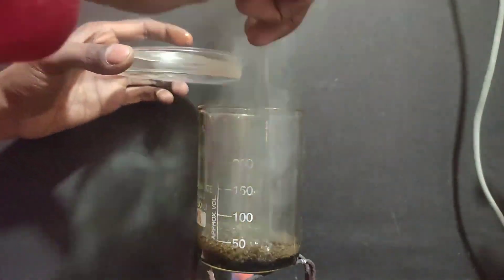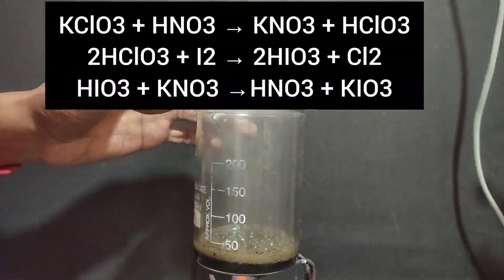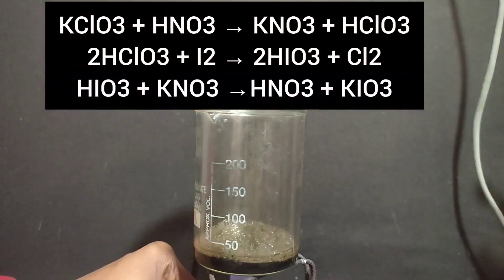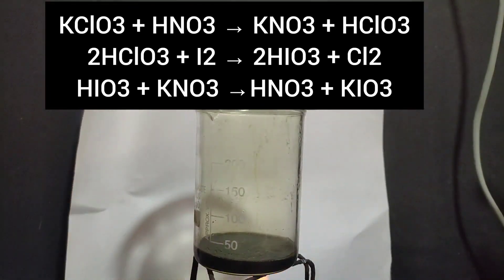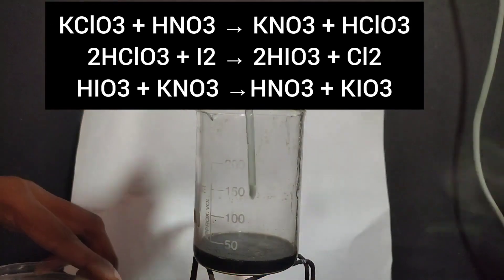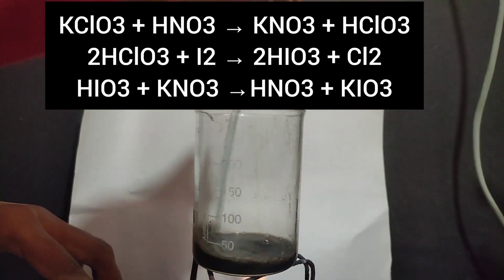But after some time, instead of iodine vapor, greenish yellow chlorine gas started evolving. Iodine reacts with potassium chlorate in presence of an acid to form potassium iodate and chlorine gas. This is because iodine has more affinity towards oxygen than chlorine. The reaction was carried out until no more greenish yellow gas was evolved and solution turned clear.